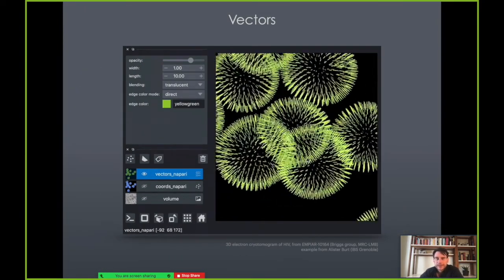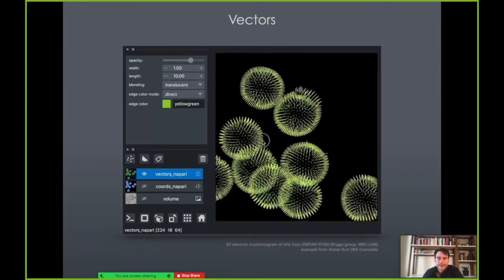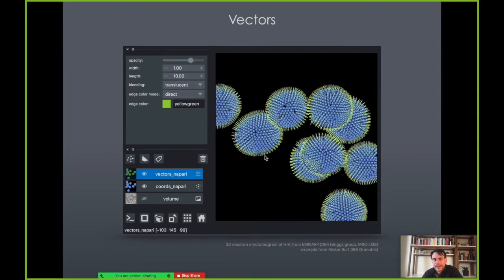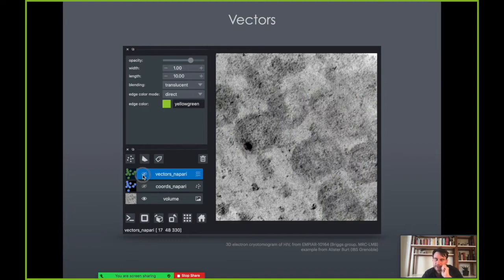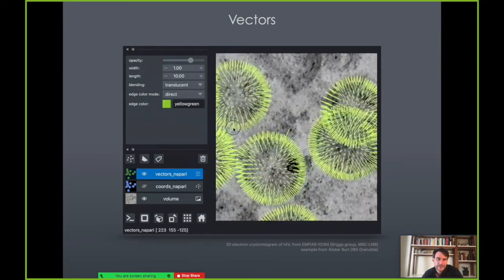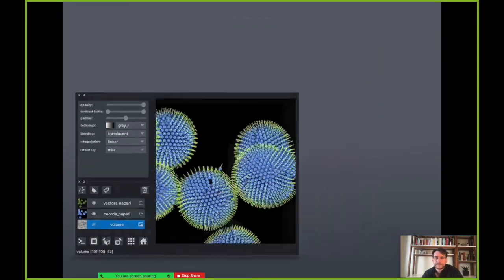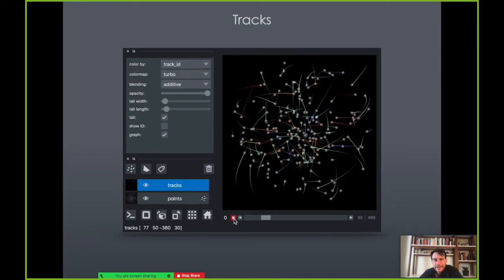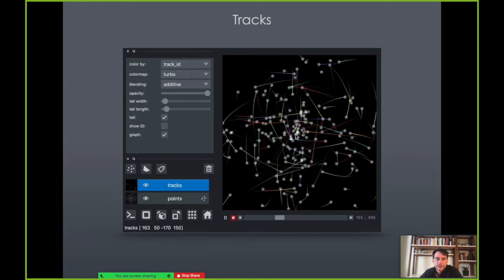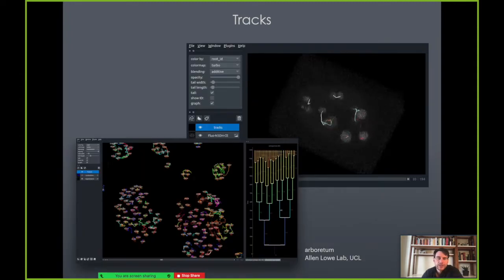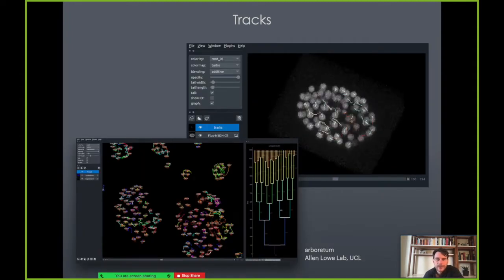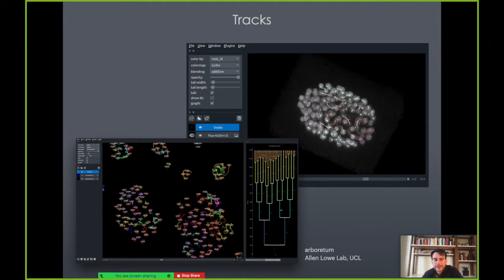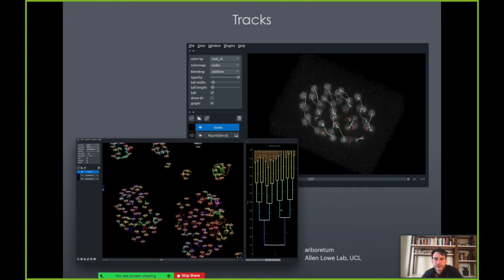Vectors is another layer type. This is some nice cryo-EM data from Alastair Burt, where he's using the vectors layer to indicate the orientation of features of interest in the dataset — you can see all those lines. We also have a really nice tracks layer, which you can use for tracking particles or tracking cells. It was contributed by Alan Lowe as part of his work on the Arboretum package for lineage tracing and tracking in Python.